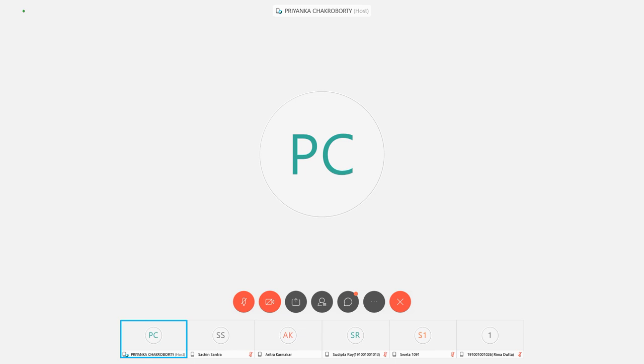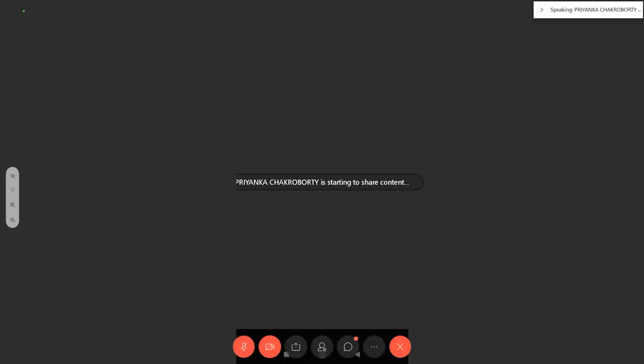Next we will start the demonstration video of carbonyl functional group detection. This video is a longer one because it contains a lot of stepwise functional group detection tests, so it takes more than 10 minutes. So next we will see the video of carbonyl functional group detection. Okay, I'm sharing my screen with you. Just switch over to the demo.